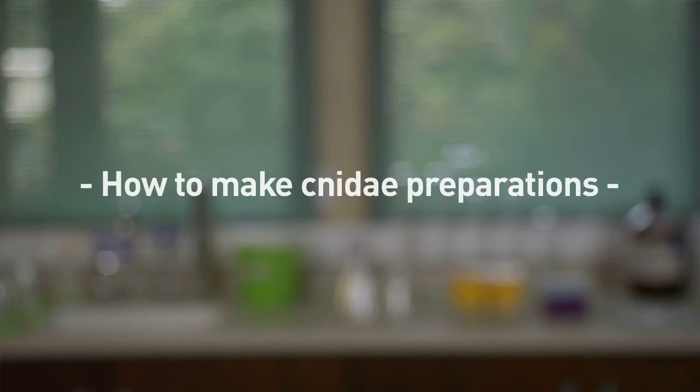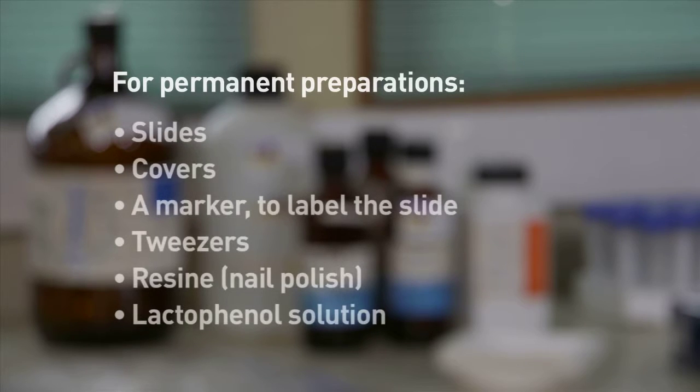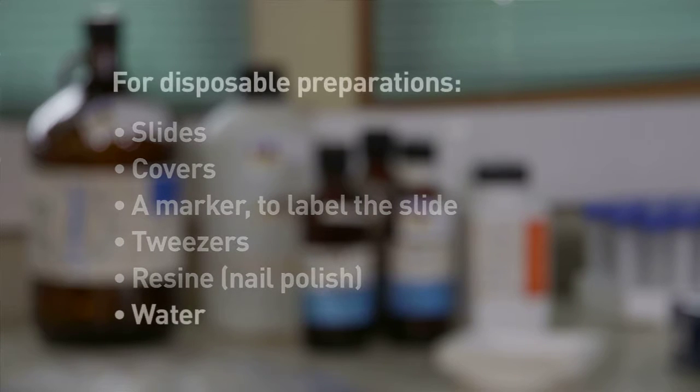Cnidae preparations can be made so they are permanent or disposable. For permanent preparations you would need slides, a cover, a marker, tweezers, some kind of resin. You would need a solution of lacto-phenol. For disposable cnidae preparations you can use water instead of the lacto-phenol solution.